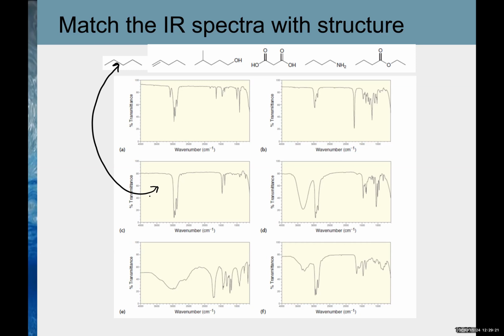I'm just looking at your thought process. How did you come to that conclusion? It just has the CH stretching on the CH2, and then bending, and it has 3 peaks, right? This one, and this one. So it's an alkane. You're right. Okay, so 1 is done.